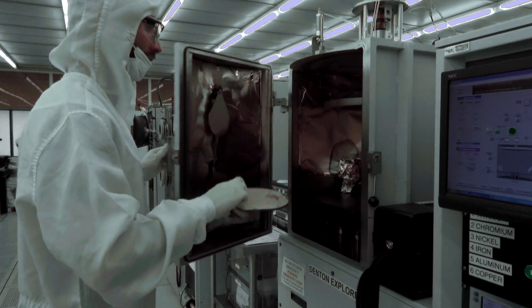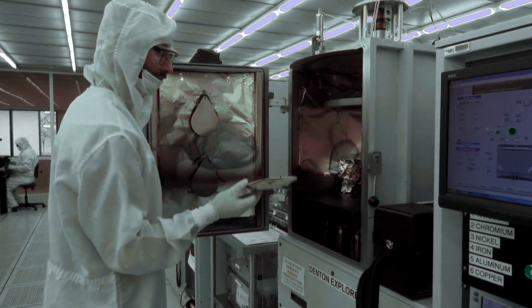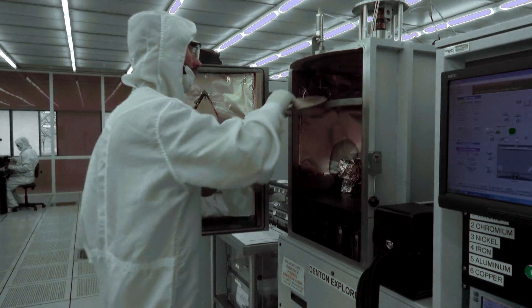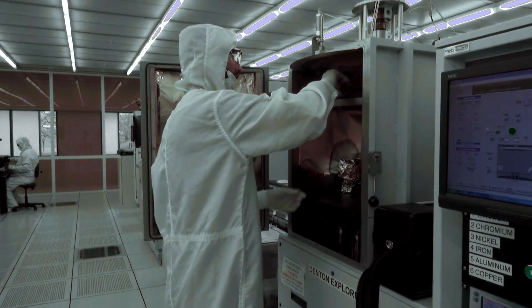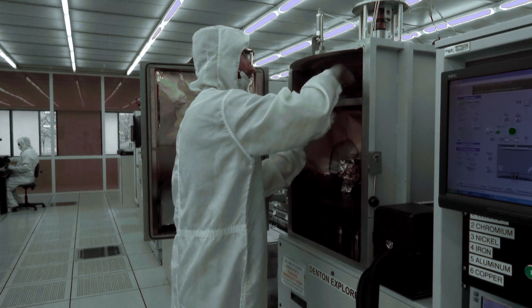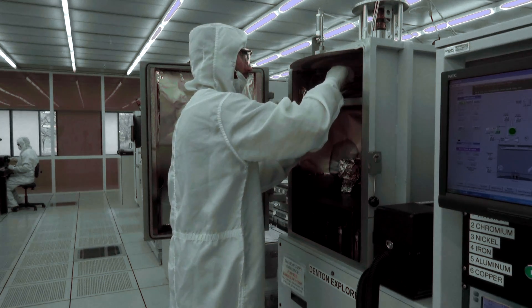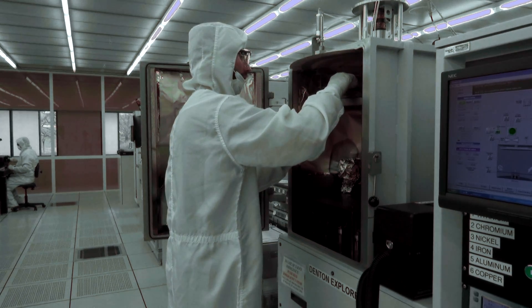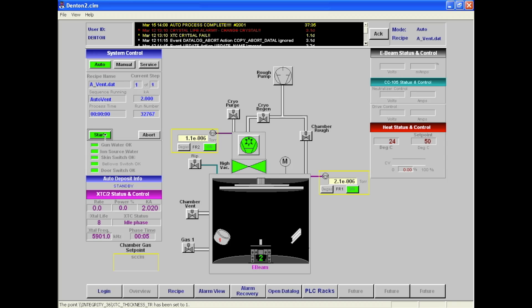After you open the chamber door, vacuum inside of the chamber. Then place your sample in the sample holder frame and slide it in. You may need to use the motor rotation control button to adjust the holder frame's position.